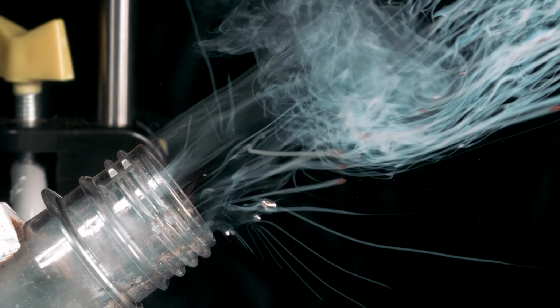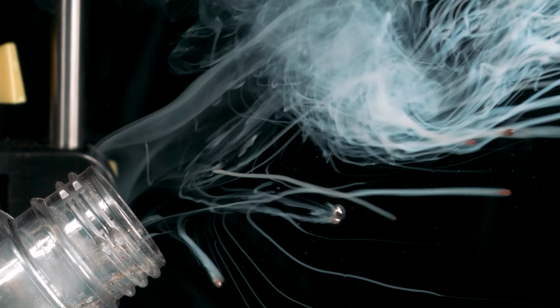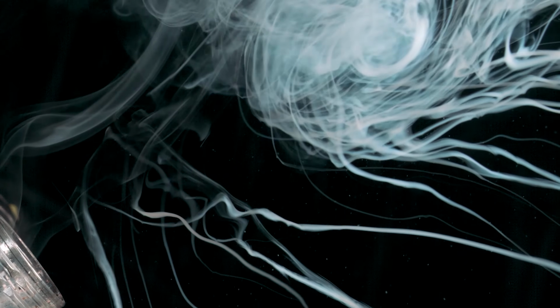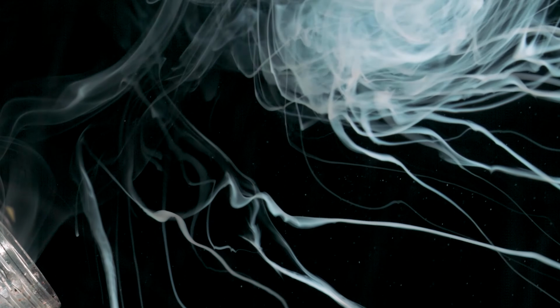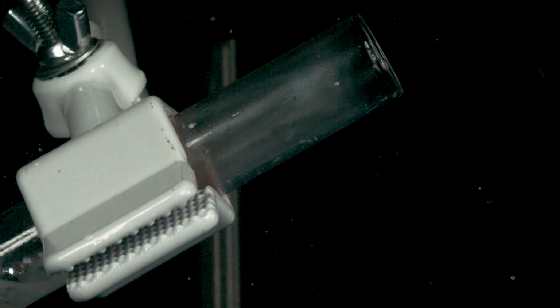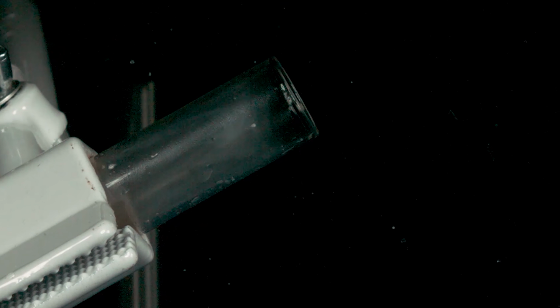If you look closely, you'll see molten bits of potassium that are glowing like a pale amber or a pale violet in color. And if you look, the smoke itself is really cool with the vortices and the rotational motion as it goes off of the top edge of the frame there. As a point of comparison, here's sodium doing the same thing.